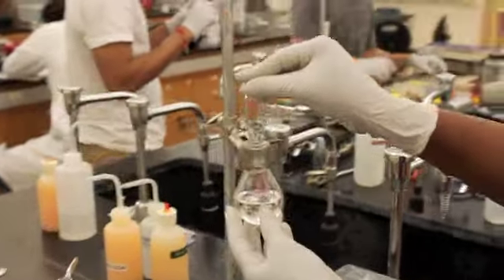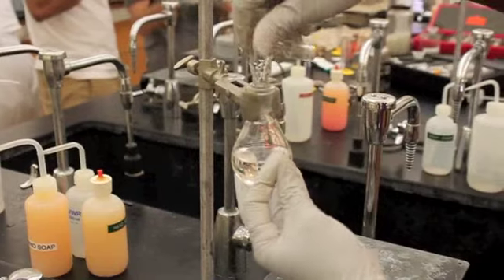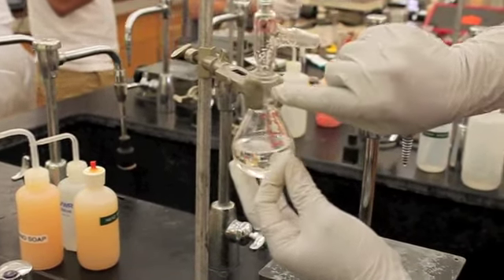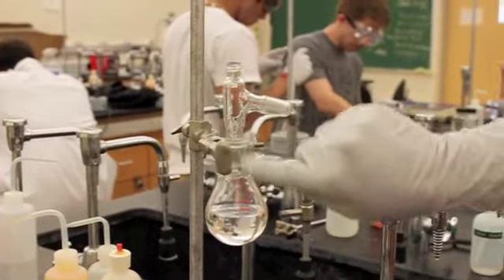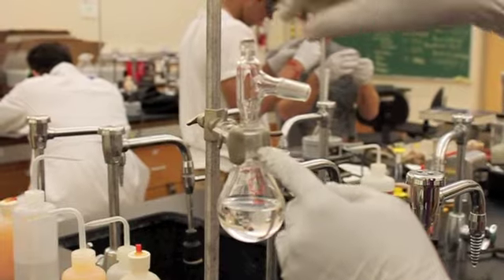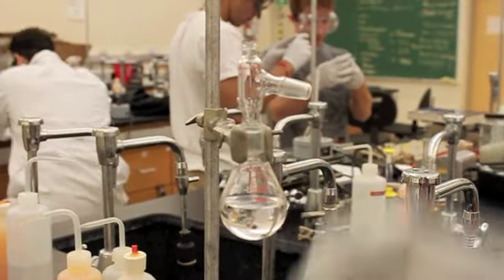You'll oil it and you'll put it into the round bottom flask, and you'll turn it. As you turn it, you'll notice that there'll be a little bit of color. Next, we're gonna add our distillation adapter. But before we do that, you wanna fit the thermometer onto it. Now, when you open up the distillation head, that's a seal. It's a tight seal.